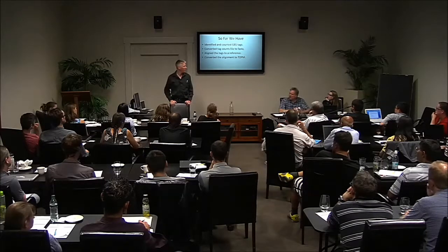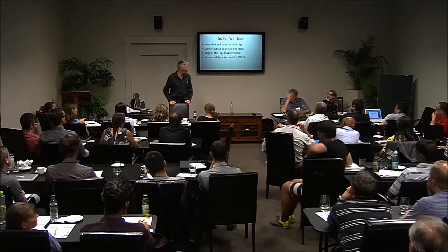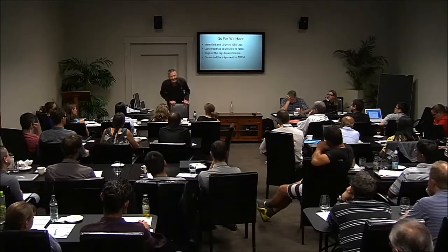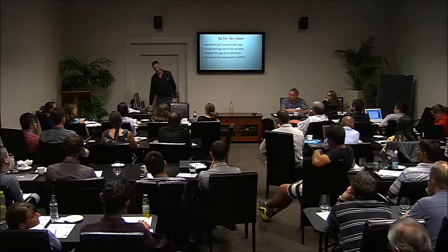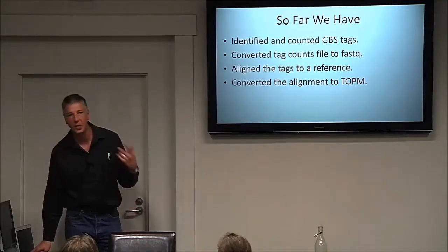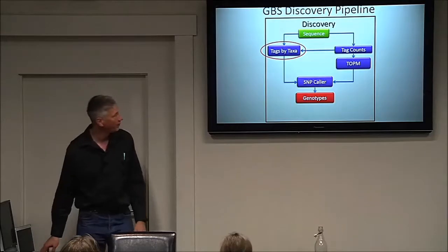So whatever the aligner tolerates. Yeah, and then you have to define that for your species. It's another dial, right? And it's useful to do some testing. This is why I spoke earlier today about testing things, and having external data sets that you can work with.